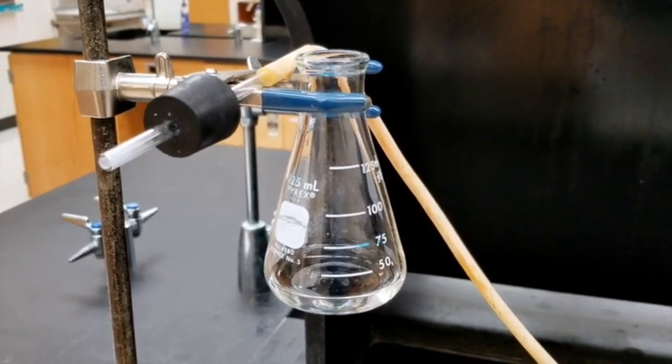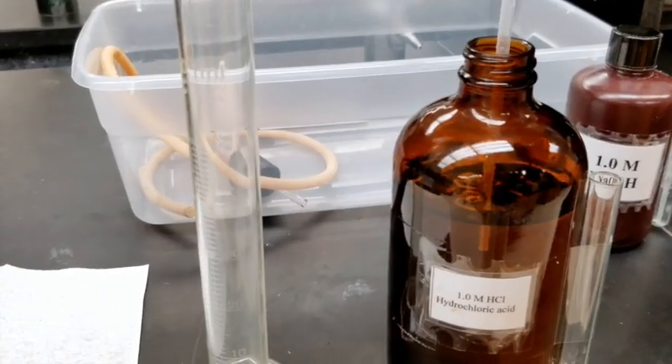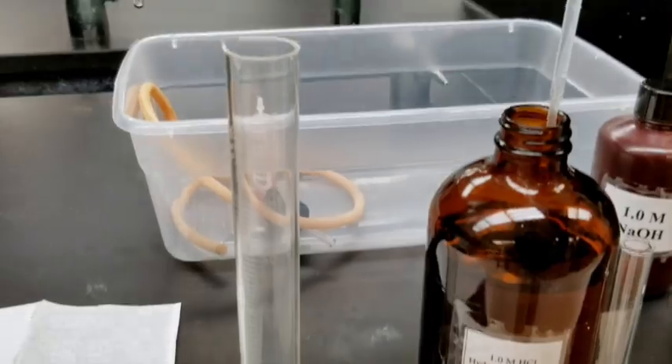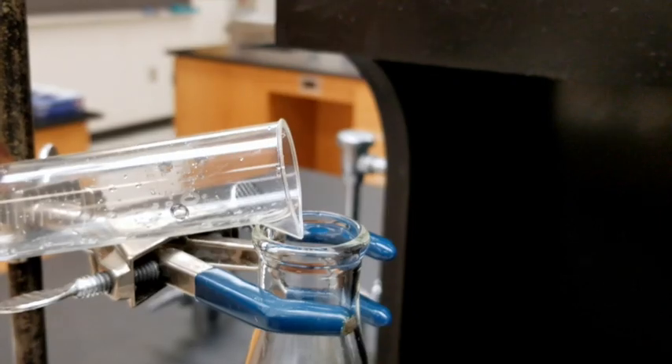Mount the other Erlenmeyer flask on the ring stand as shown in this video. Use your 15 milliliter graduated cylinder to measure out 15 milliliters of one molar hydrochloric acid.